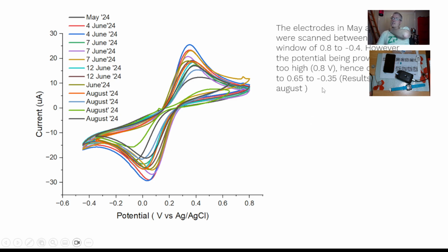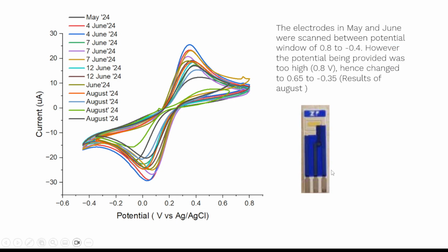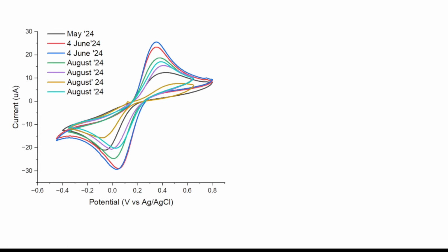It's probably just worth saying as well, this person's giving us some teaching here actually, that the person before was using a window on that ferricyanide experiment of like -1 volt to +1 volt. This person's actually narrowed that window down a little bit, which is probably a more sensible thing to be doing. So you can take essentially some learning from this. I'm just gonna zoom in so you can still see that a little bit better. And it's on one of our gold electrodes.